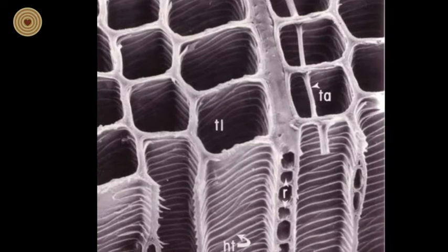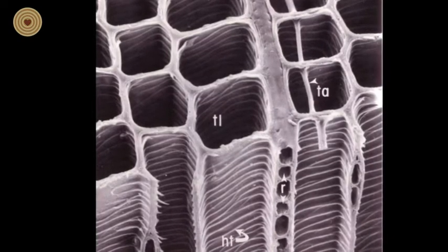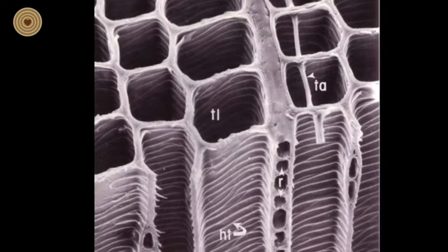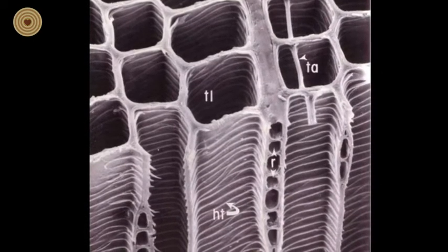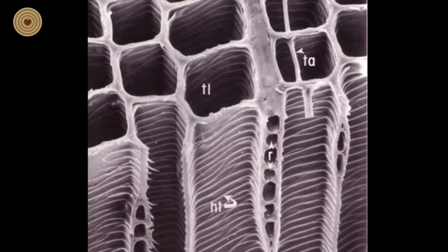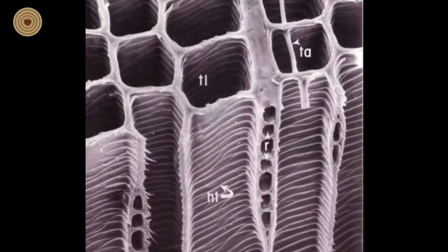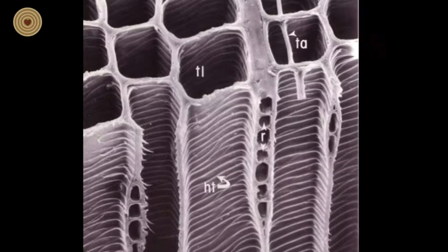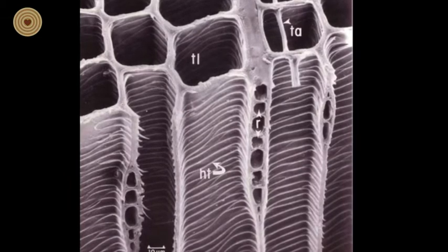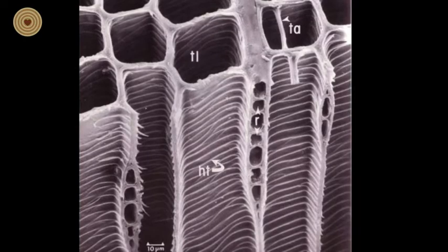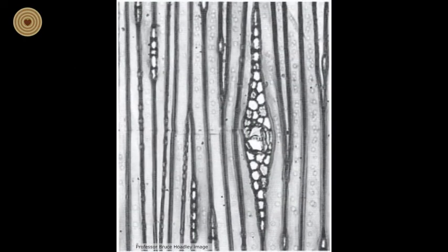We have not yet discussed the tangential surface of wood, which is this surface on the lower portion of the image of a sample of Douglas fir wood. Because the rays extend in a radial manner in the wood, we are viewing the rays here in cross-section on this surface. Some of the rays are just a single cell wide, as shown here. But in some cases, the rays can be multiple cells in width. We have discussed vertical resin canals already. But note that horizontal resin canals can also be produced in some woods. You can see a horizontal resin canal here, located in the middle of a ray. When this type of resin canal is formed in some softwoods, the ray type is known as a fusiform ray.